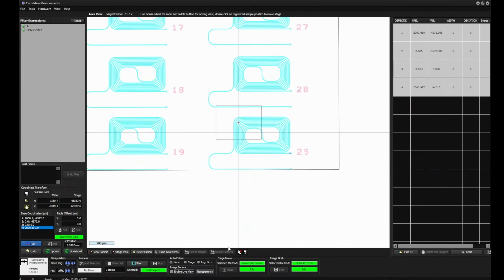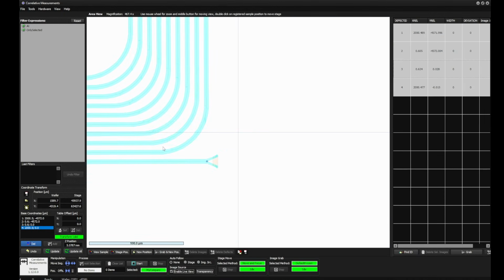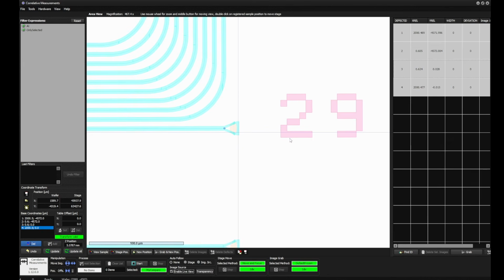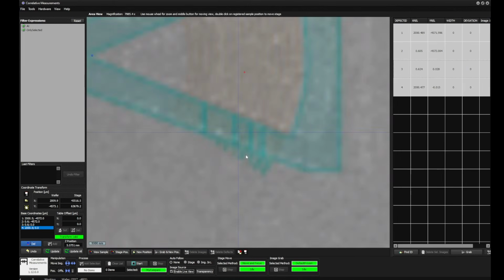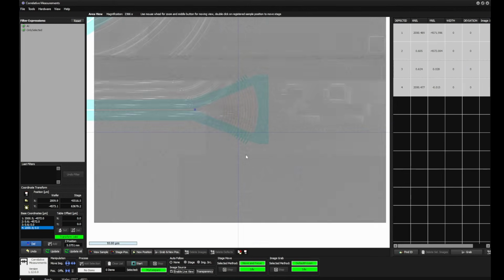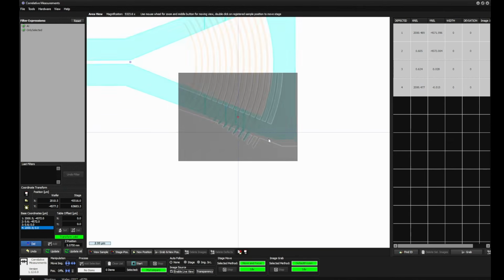You can see you can overlay the electron microscope image. You can work with the structures. You see immediately the deviation. If we wanted to have more or less highest precision, maybe at this point here, and you are looking for some very small things, then you may want to increase the precision locally, because when you are here anyway, then this could be a good idea.